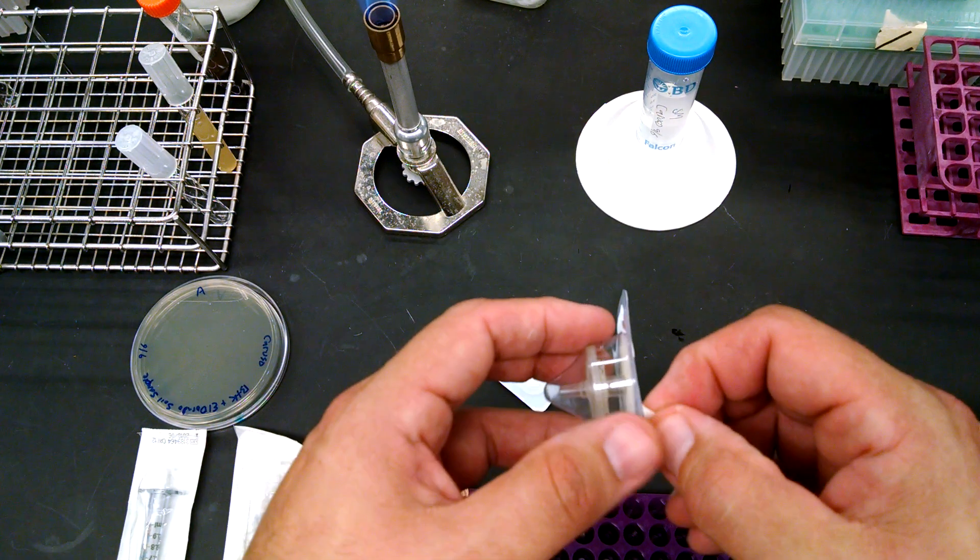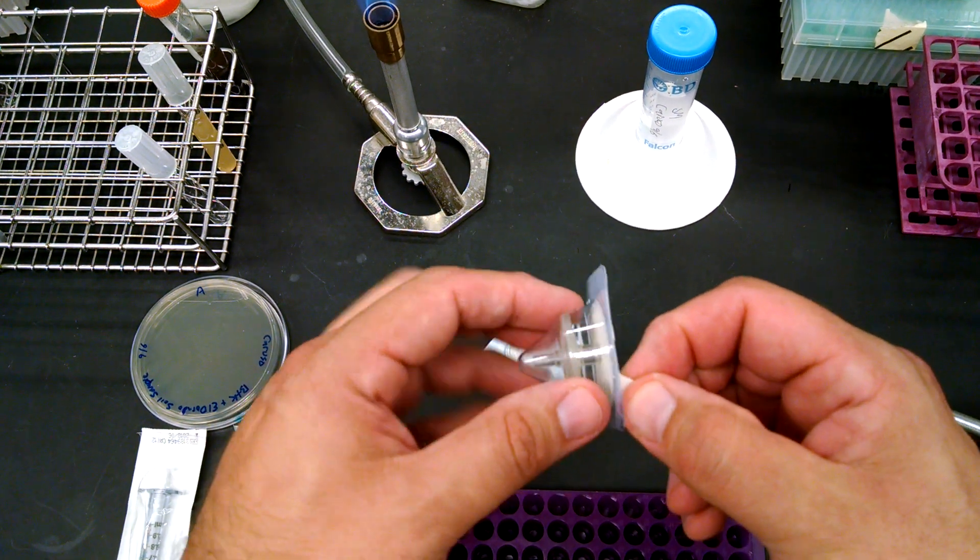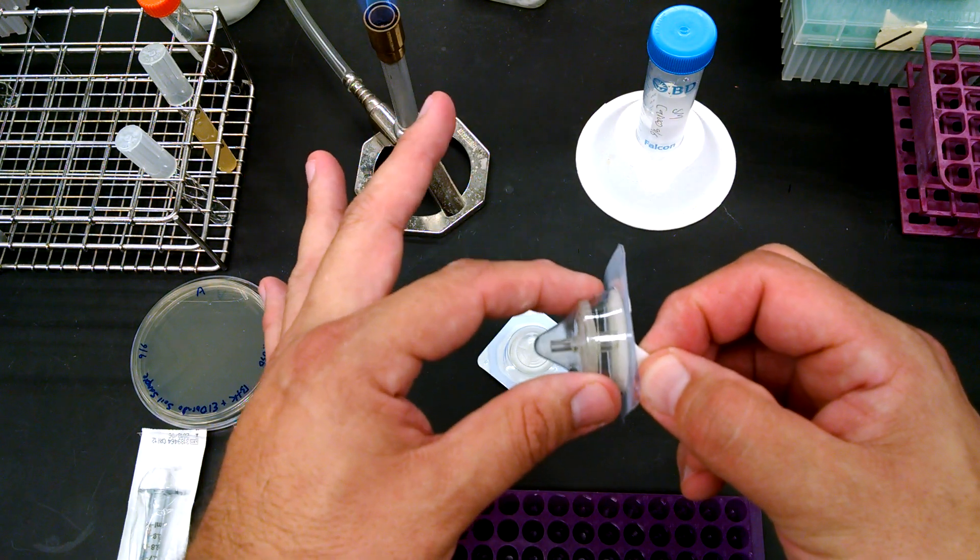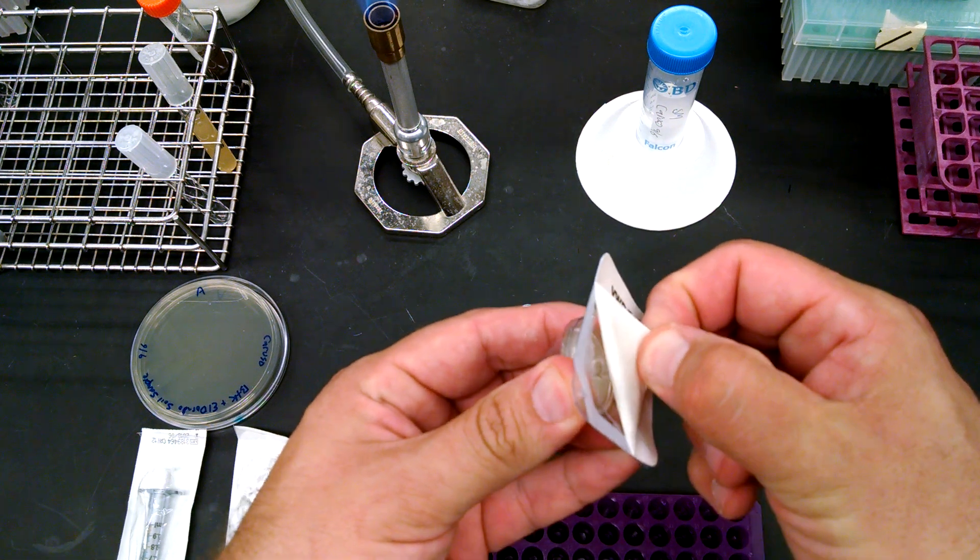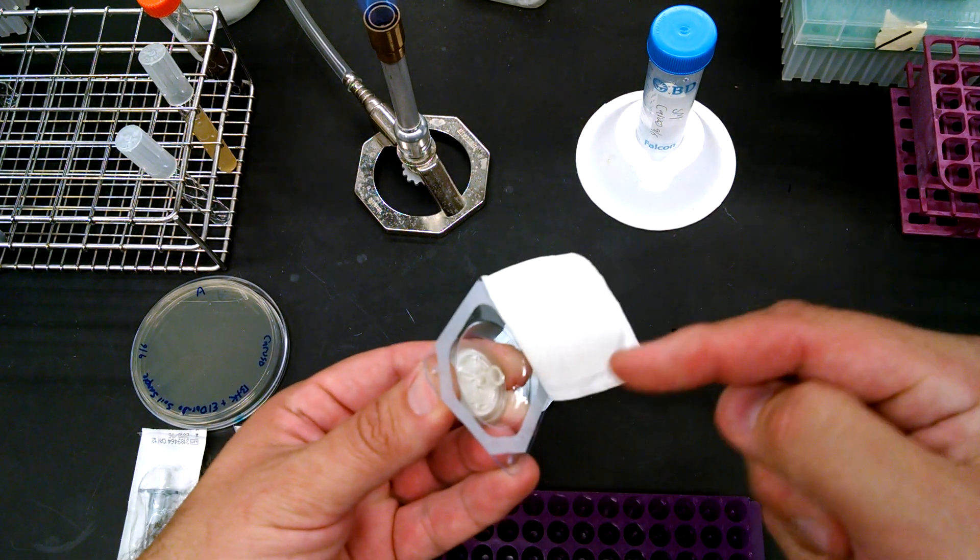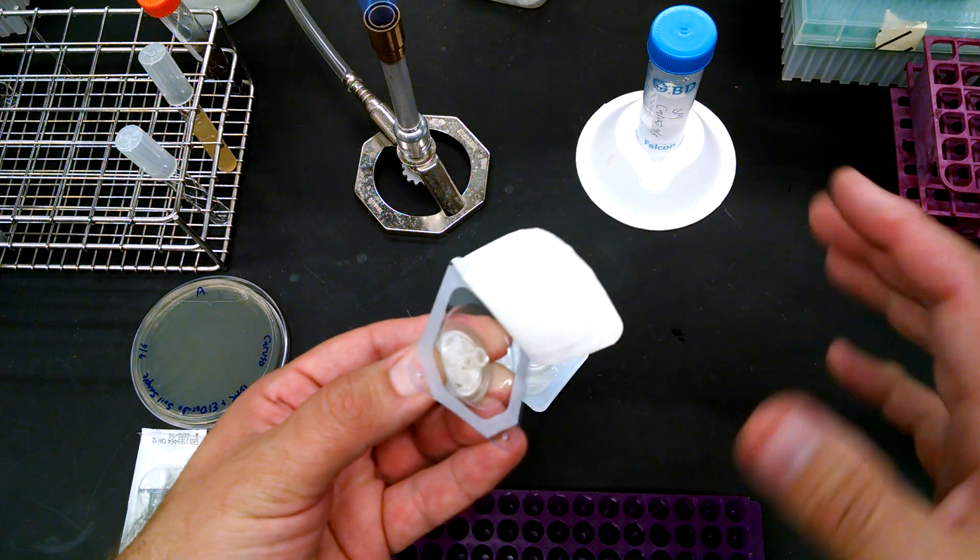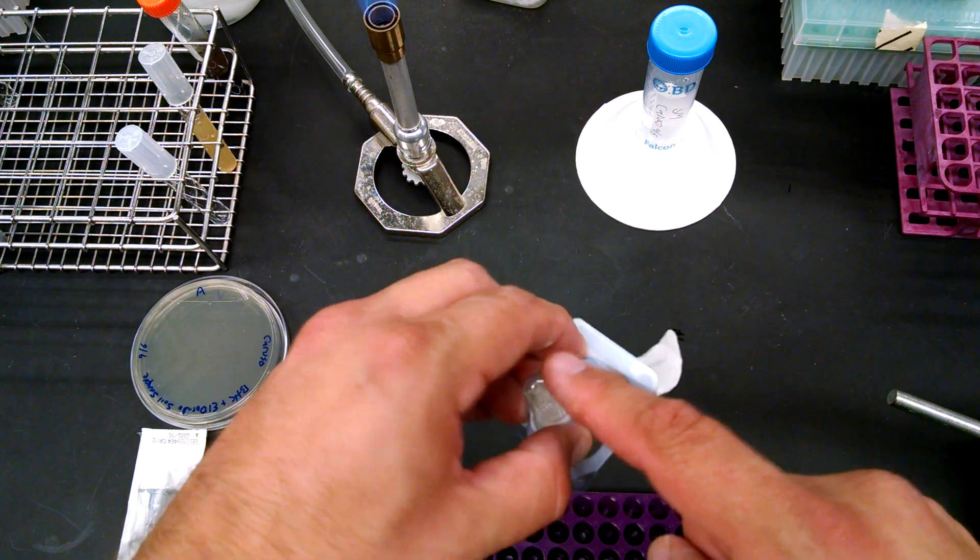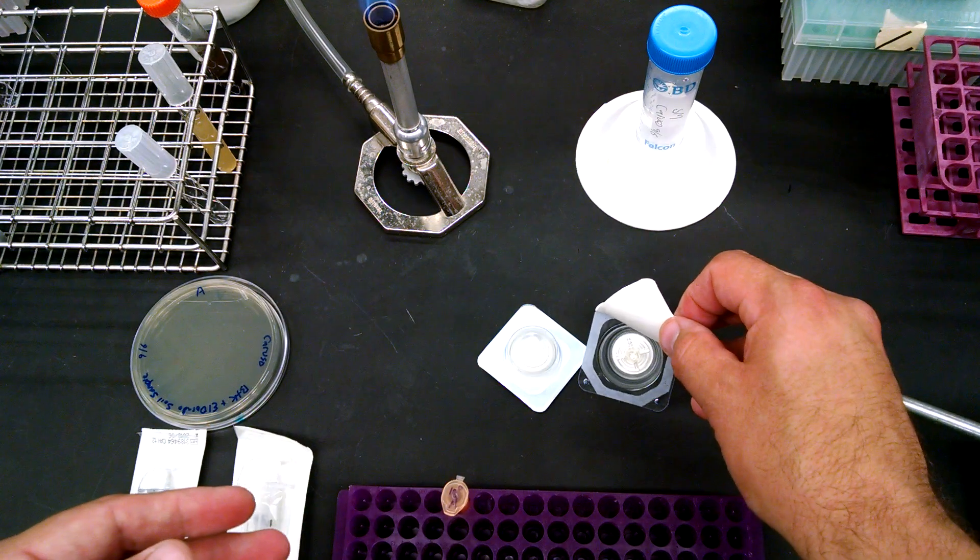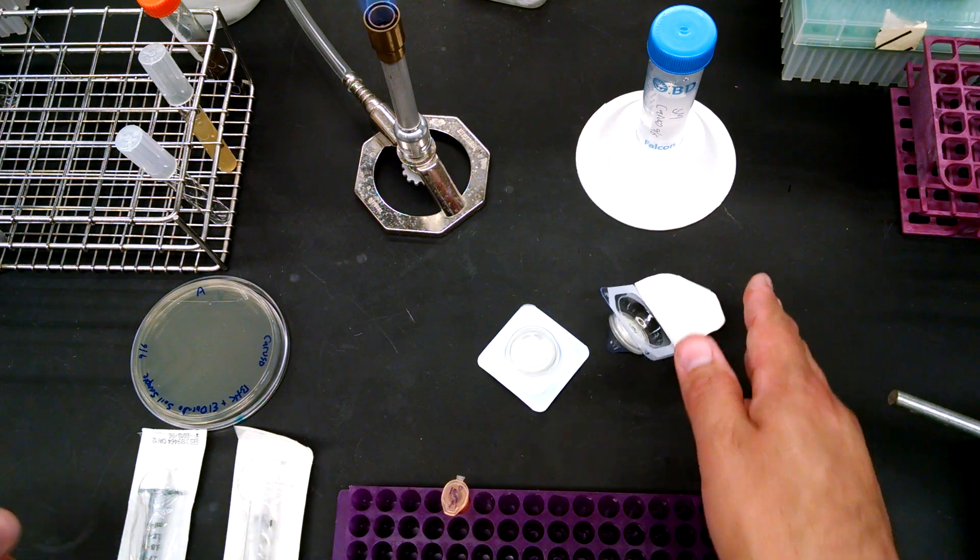And so I'll demonstrate that here and show you how you can use these filters. Now when you're doing this, what you want to do is you want to open one of these filters, grasp the sides of the disc, and just peel this off and then leave it in the container because you don't want to touch it, right? Definitely not this side, okay? And then just kind of place it down out of the way.